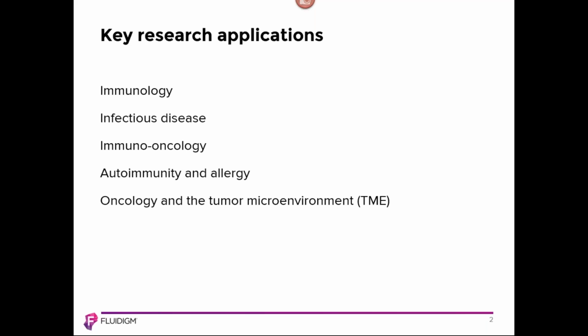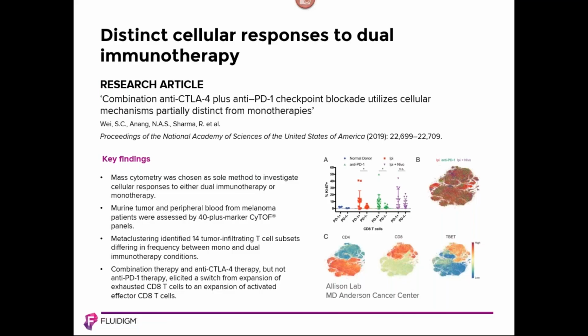Due to time constraints, we will not be able to cover all applications in great detail today. Please don't hesitate to reach out to the mass cytometry or imaging mass cytometry FAS in your area to learn more about our technology and how it can be applied to your specific research questions. So first we'll discuss some key research applications using mass cytometry.